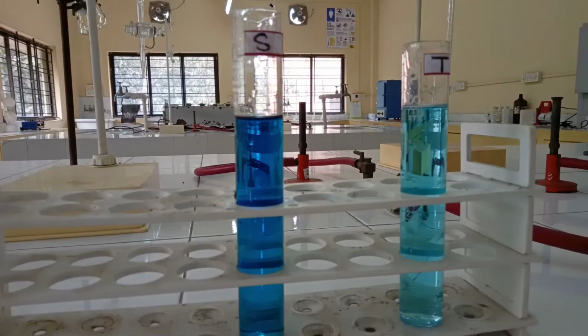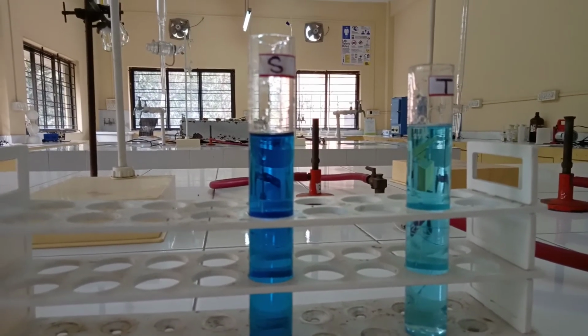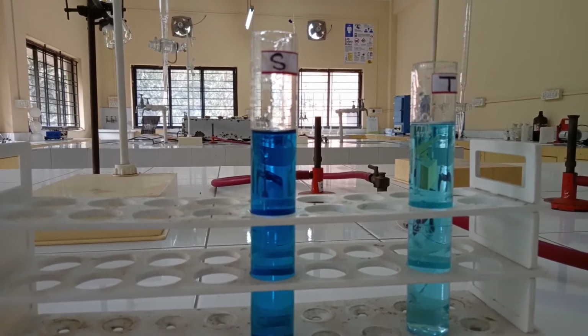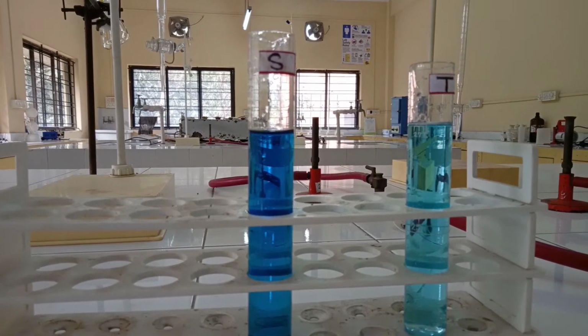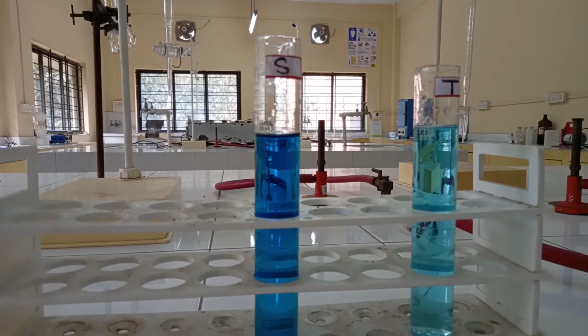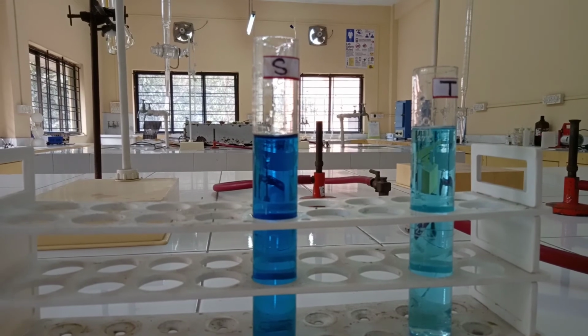So finally, as you can see, the color developed in the test sample is less intense. The color of test sample is less intense than the standard. So we say the test sample passes the limit test for iron.